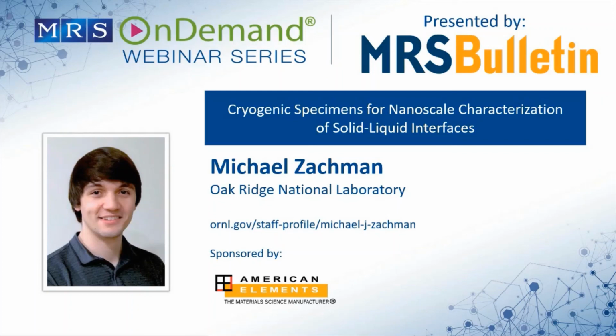The concern was that lithium can interact with nitrogen, which if you leave it out in the air, you'll see that. And we have very, very concentrated nitrogen, and so that could potentially lead to a very quick, potentially violent reaction. But what we ended up finding in our experiments was that it didn't. So that's a very good and important question, and I'm glad you asked, because that would be kind of terrible for all of this if that had happened.